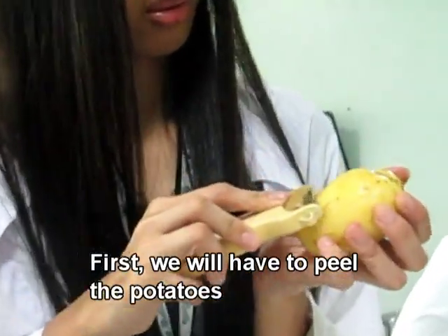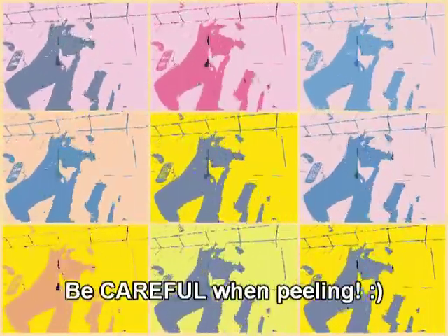First, we will have to peel the potatoes to remove the skin. Be careful when peeling.